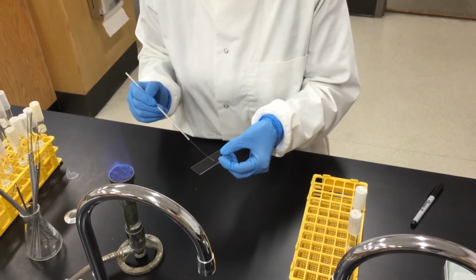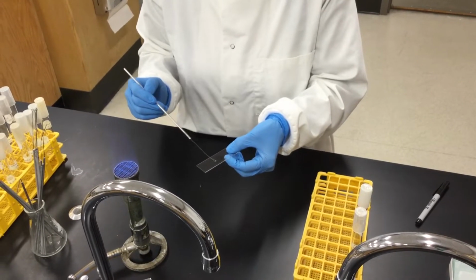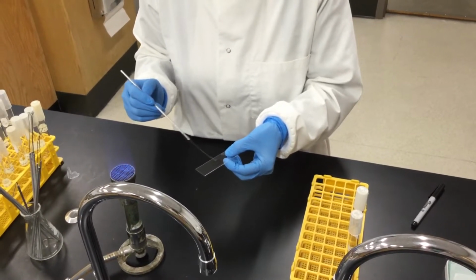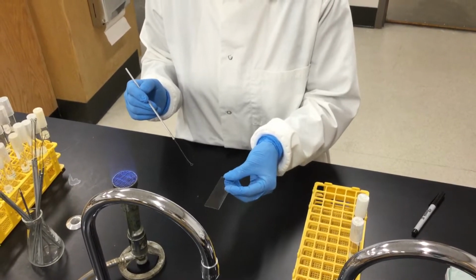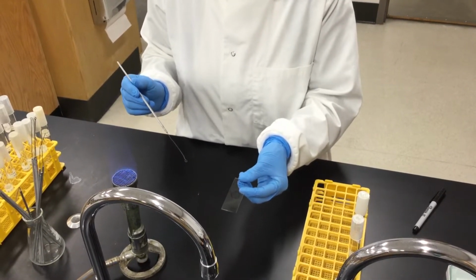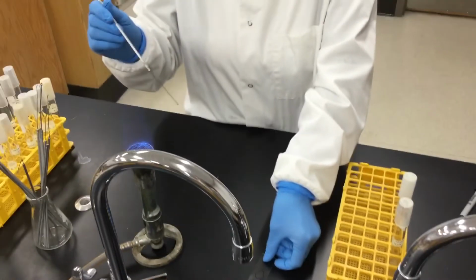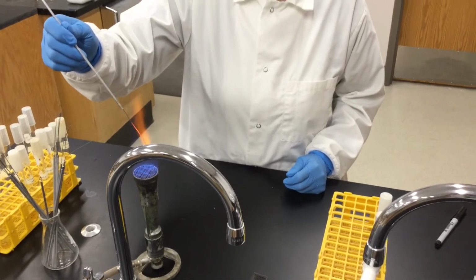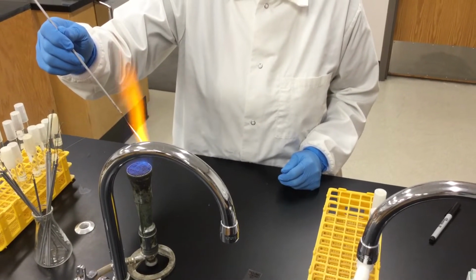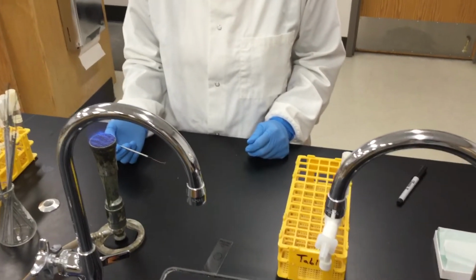And then in a circular manner, spread it around the area where you marked below on the glass slide. So over there the film is very thin, the smear, that's what we call the film. Let it dry, put it in there, and then sterilize your loop at a 45-degree angle, and then let it cool.